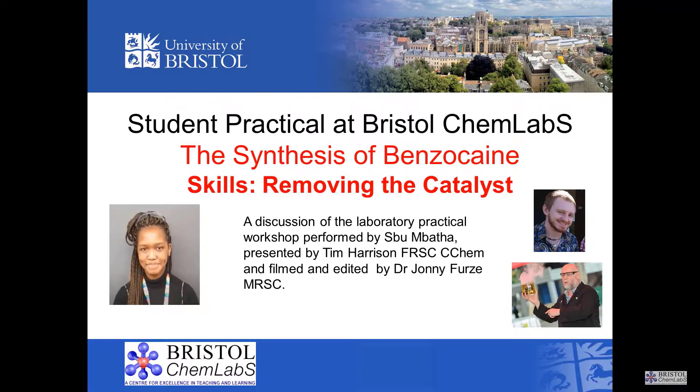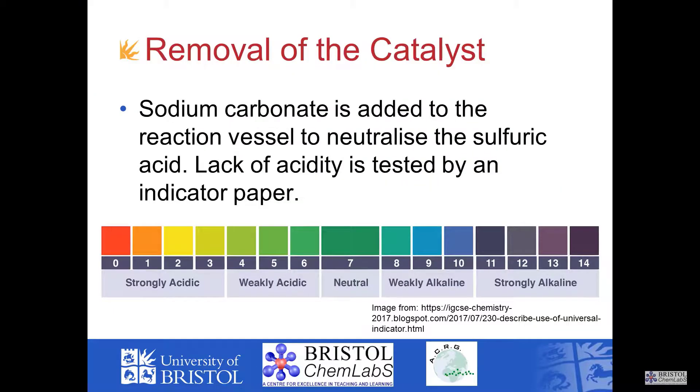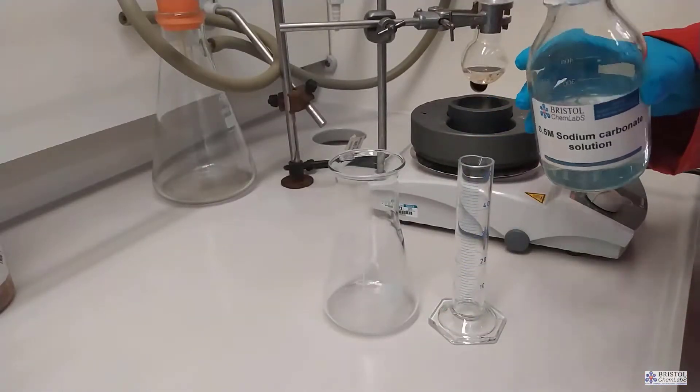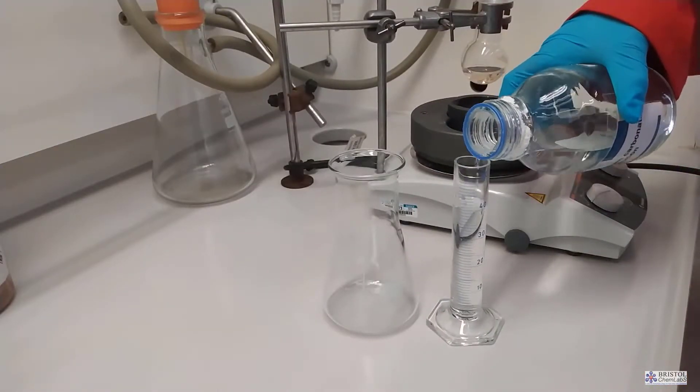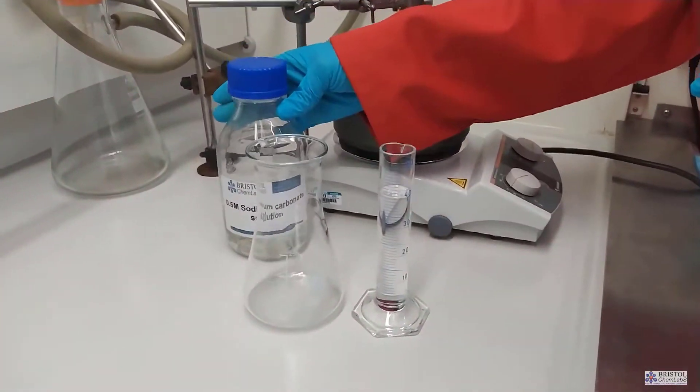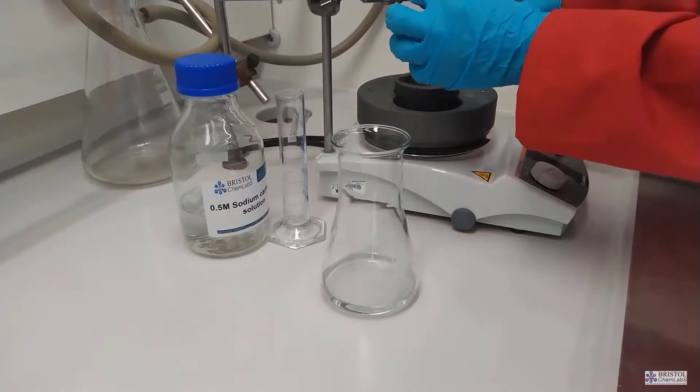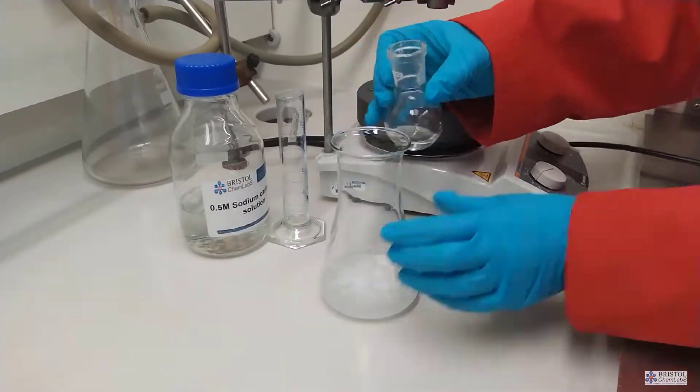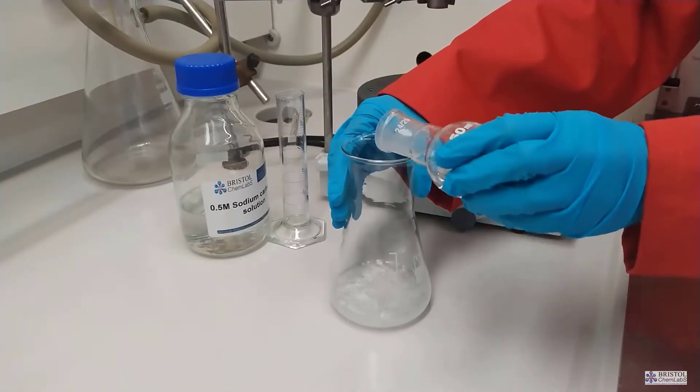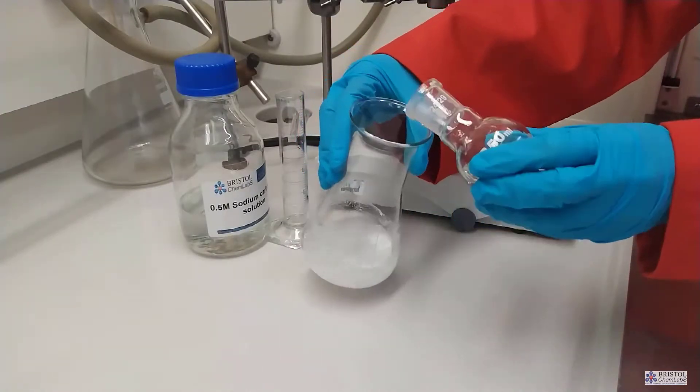Once the reactant mixture has finished its reflux and has been allowed to cool we now need to get rid of the catalyst. Catalysts in this case concentrated sulfuric acid don't get used up during a reaction so we're going to neutralize the sulfuric acid using sodium carbonate solution. Our reaction mixture is poured into a measured volume of sodium carbonate and is left to react. Acid plus carbonate makes salt plus water plus carbon dioxide.